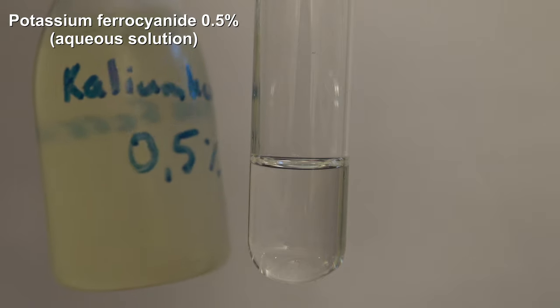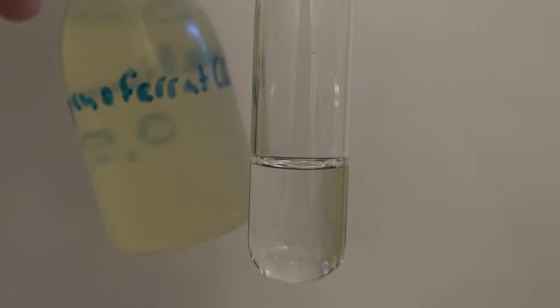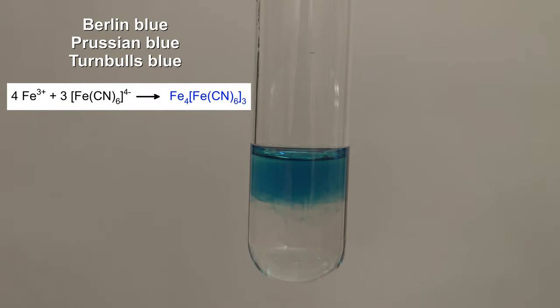Then a 0.5% aqueous solution of potassium ferrocyanide was added to the filtrate. This reacts with iron-3 ions to form a blue compound that is known as Berlin blue, Prussian blue, or Turnbull's blue, which is a proof of the presence of iron.